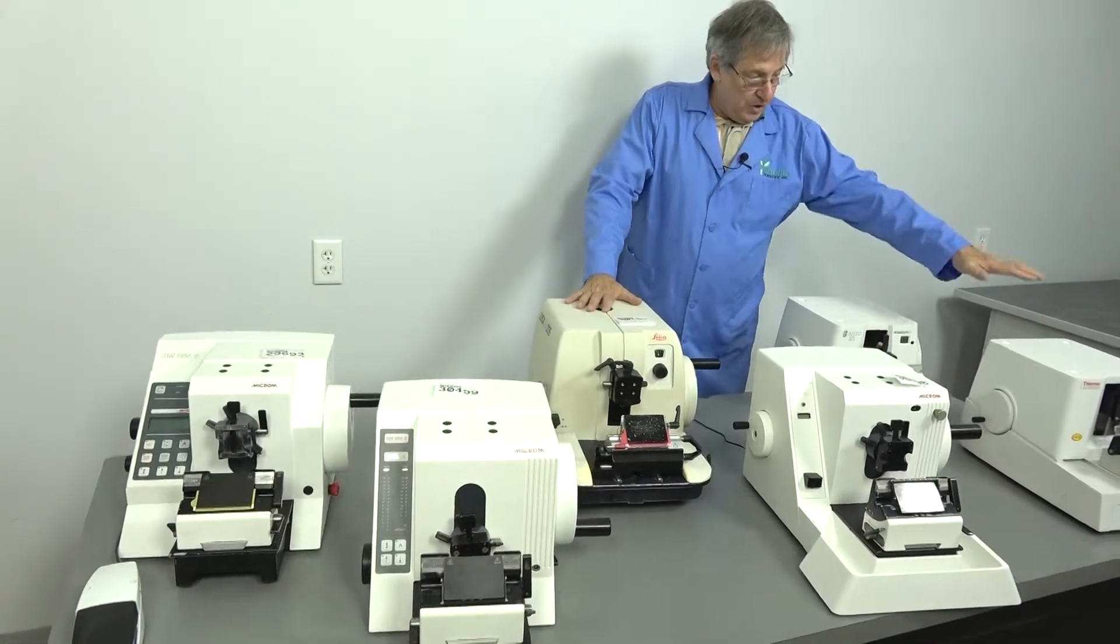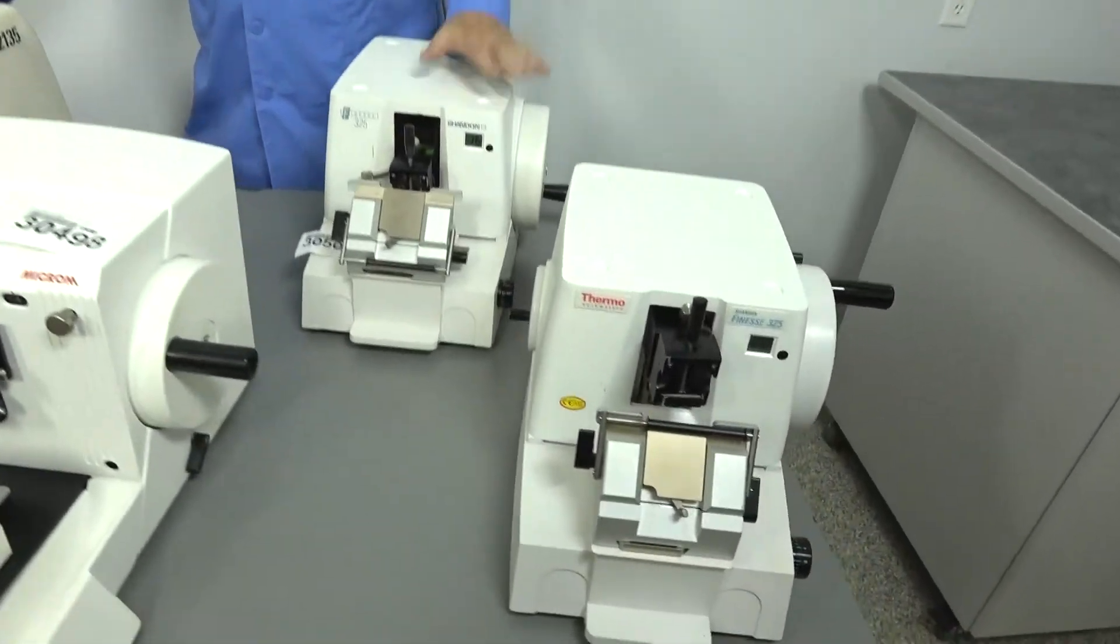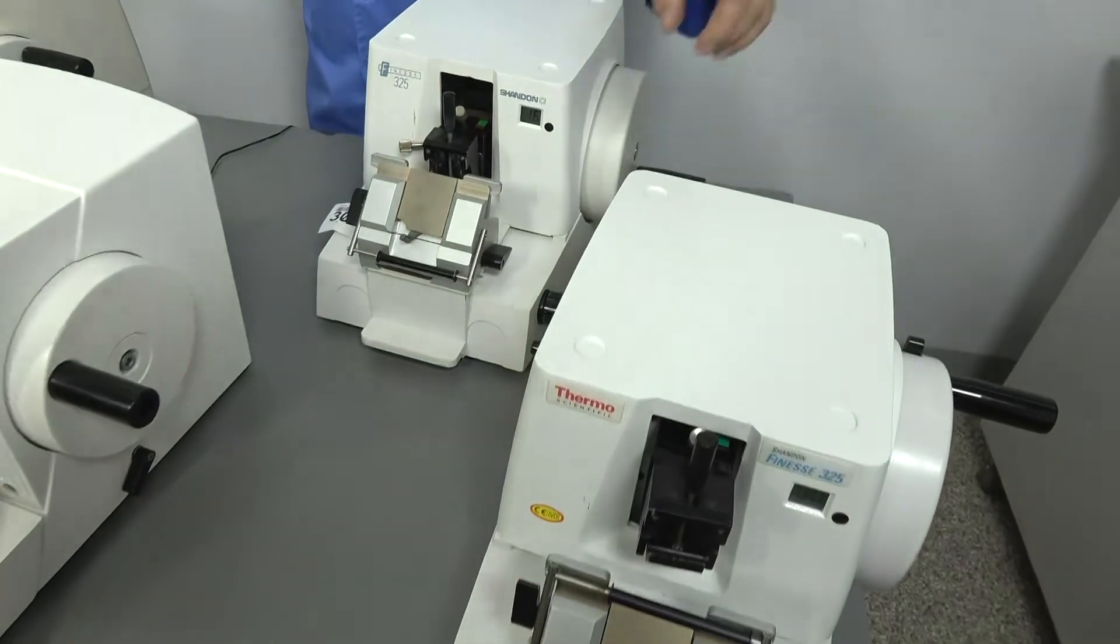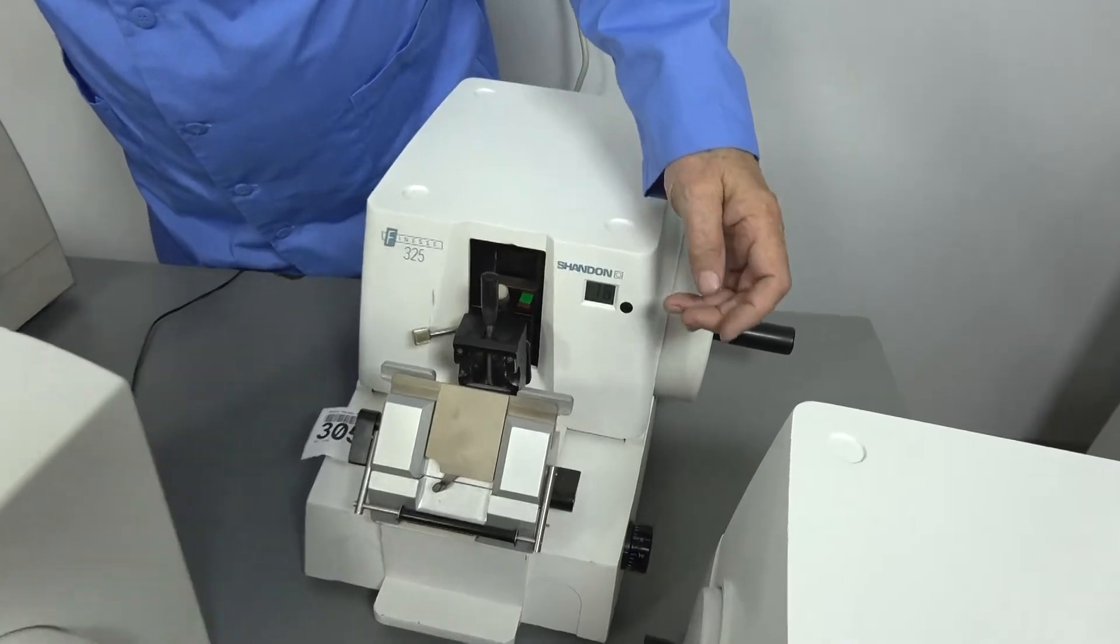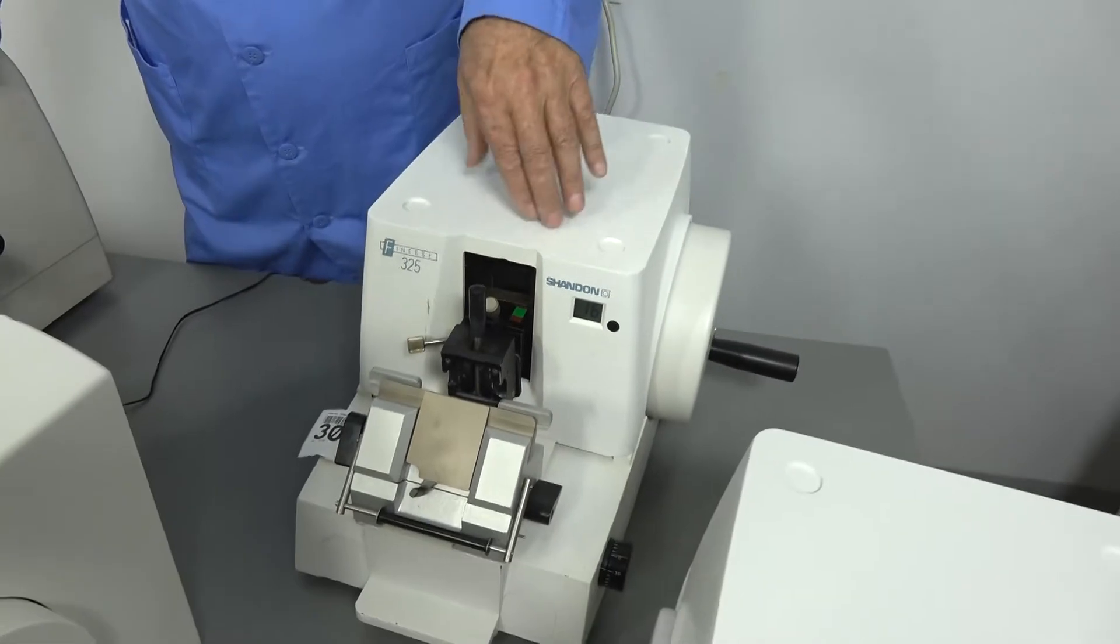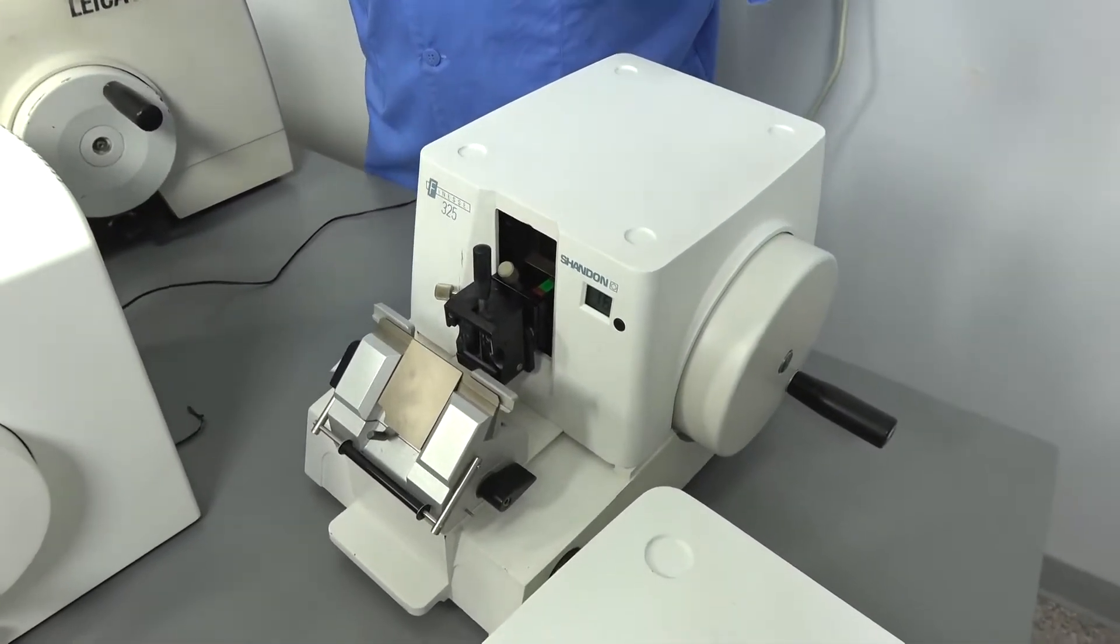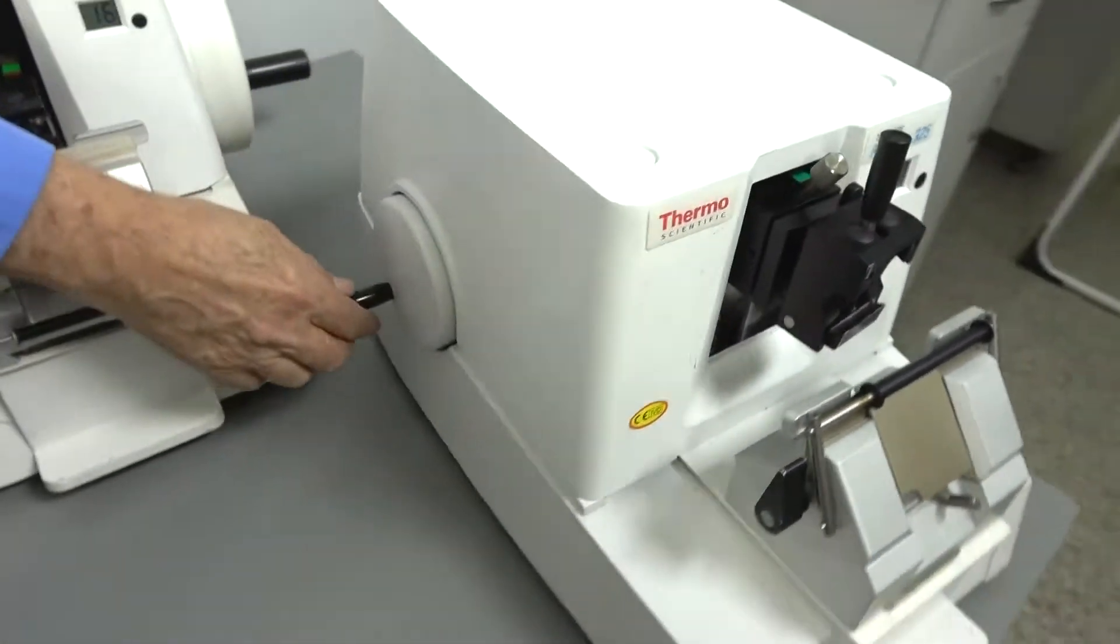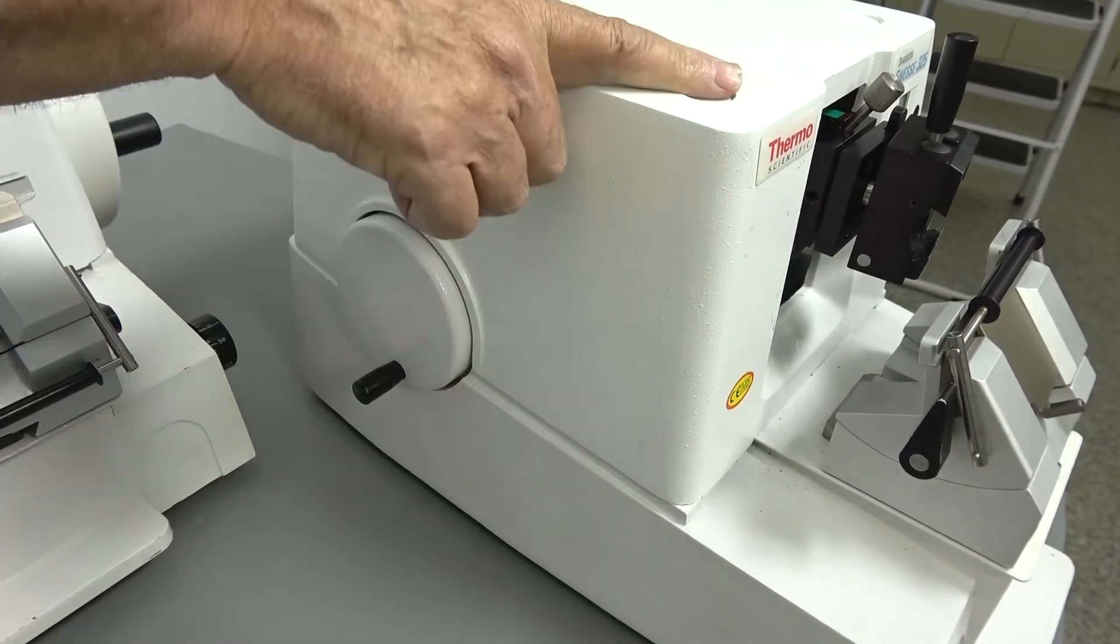Here we have two Shandon Finesse 325s, fully manual microtomes. They require no electricity other than some batteries to run the counter and alarm system. It does alarm when your blade is at your maximum and minimum positions. The blade retraction is done by a knob here to the side, in and out, pulling your knife blade in and out.